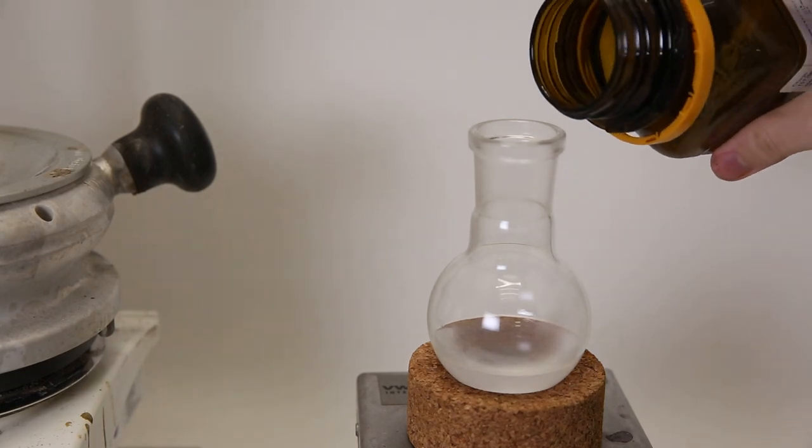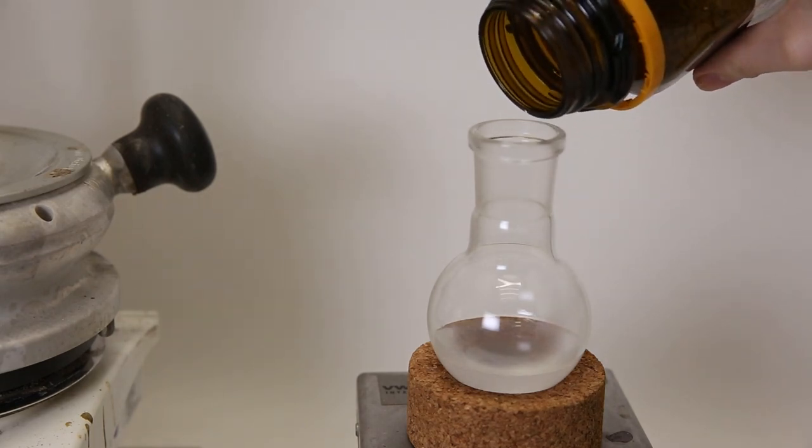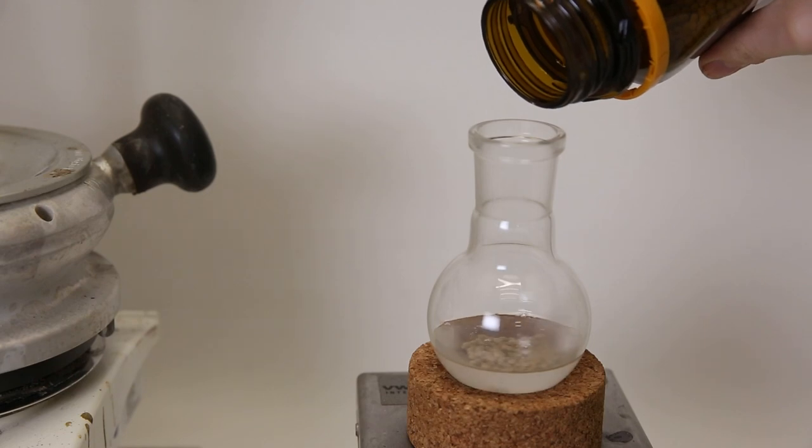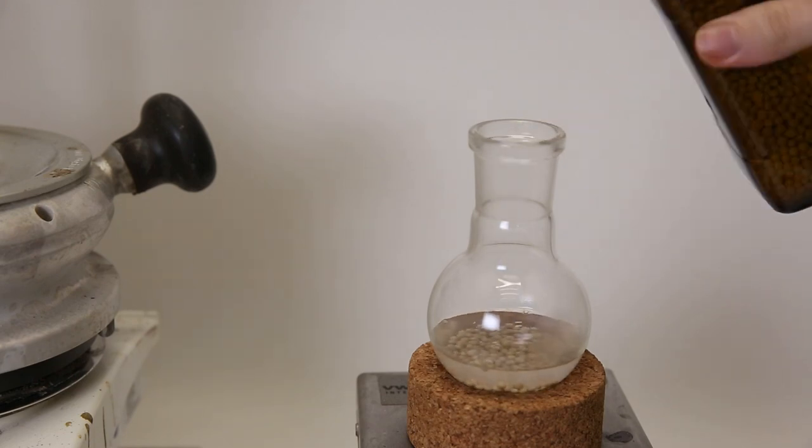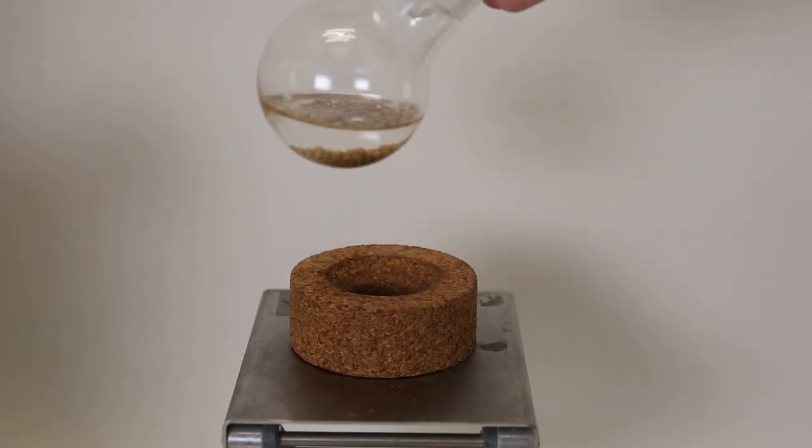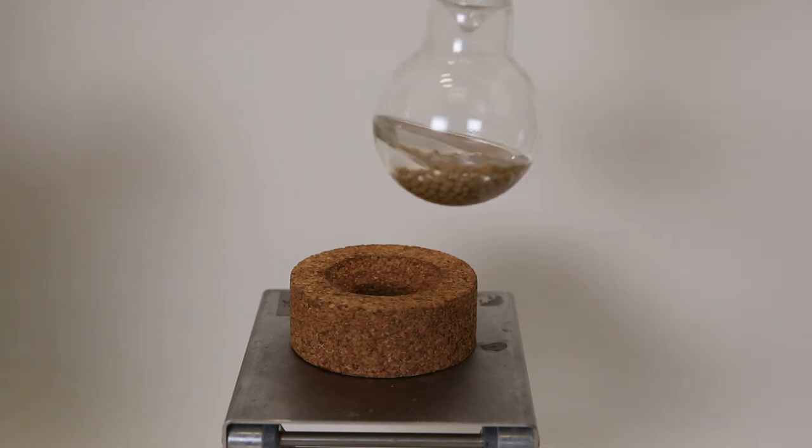So the benzene is still a little bit cloudy, which means there is water present. So I add some molecular sieves to the benzene, which will trap water inside of its structure. After shaking it, we can see that the liquid has instantly turned clear.